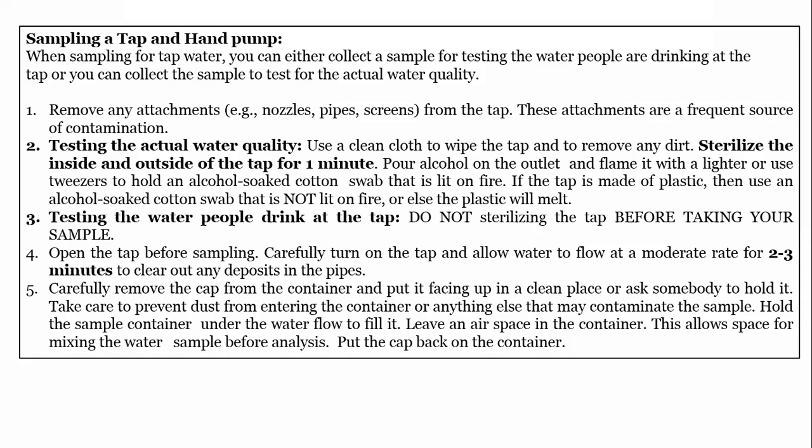So now if you want to test, for example, water which is being consumed by the population, you don't need to sterilize it, because at the head tap, many people come around to drink water. Some people maybe are playing with the head tap, and the contamination, everybody just comes and carries. And you don't actually want to remove the particular pathogens which are found in the head tap. So you want to actually test what these people are carrying to their homes. So you don't need to sterilize when you go for your sample collection. Just put your sample container like you want to carry water to drink, and open up like any other community person without sterilizing. Just open, collect a sample and close, then you take to the lab. So this is most important.